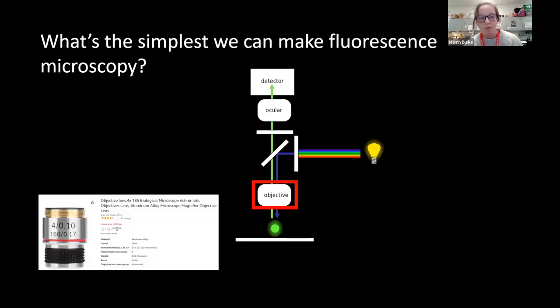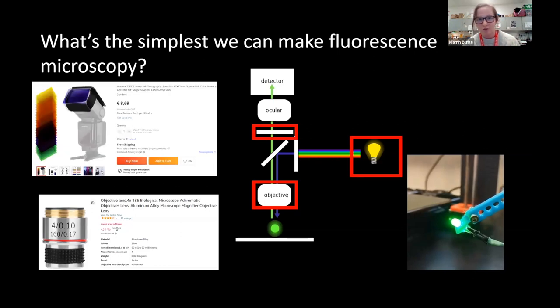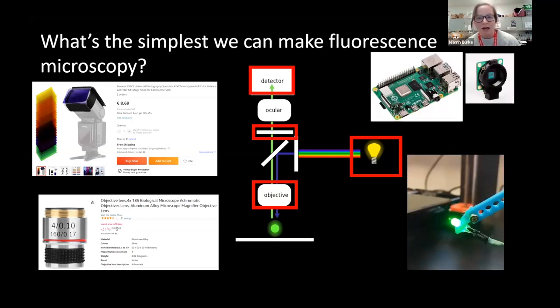You're going to need an objective lens. We can just use this cheap objective lens you can get on Amazon for like nine quid. We need an illumination source to excite our Nile Red and make it fluoresce, and we're going to use these cheap LEDs that you can get in electronics kits for kids. We're going to need a filter, an emission filter. Instead of using the traditional emission filters that you get in traditional fluorescence microscopes, we're going to use lighting gels, which are thin pieces of plastic that are commonly used in the entertainment industry or in photography to change the color output of a light. You can get these on AliExpress for really cheap, and as you can see, it does a really good job of blocking out that green excitation light. Then we need a camera to collect our images, so we're going to use a cheap and open source Raspberry Pi camera with a Raspberry Pi computer.